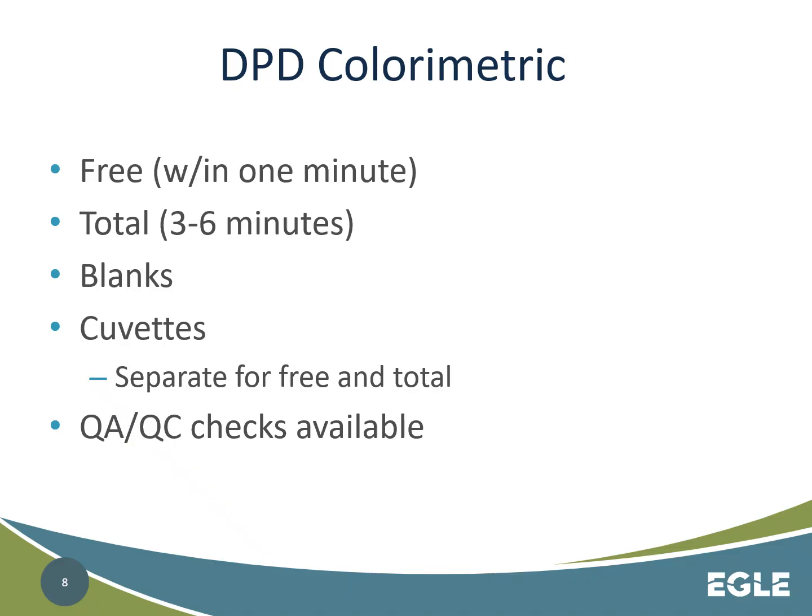On this cuvette, there's going to be a diamond, and you have to make sure that diamond matches up to the read arrow on your pocket colorimeter or your D900 that you're running. And before we do any chlorine residual, you want to make sure you have used that tube to blank it, or zero the machine, before you add your powder pillow, mix it up, and then add it back and take your reading.